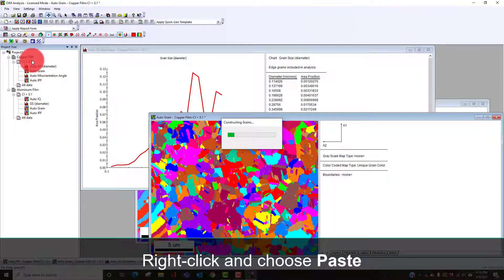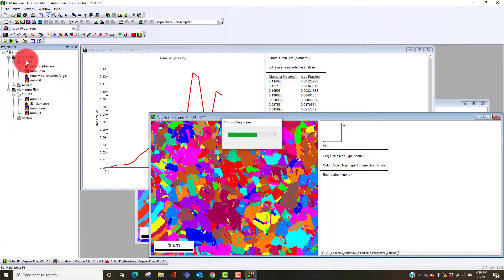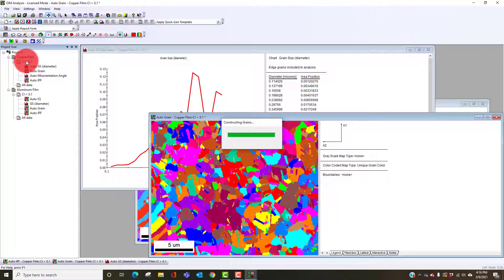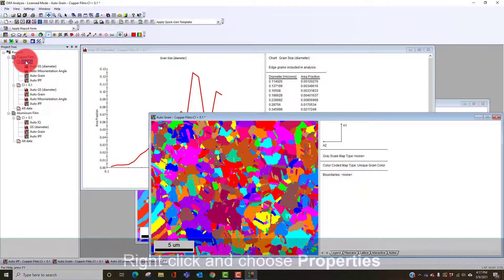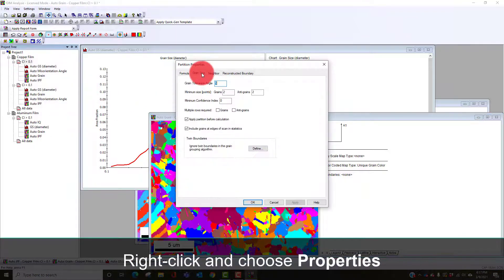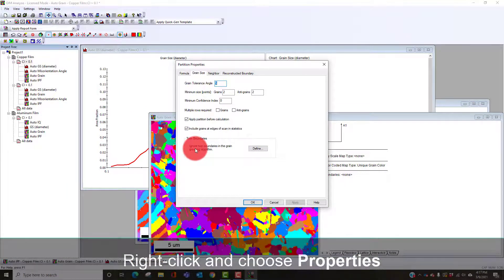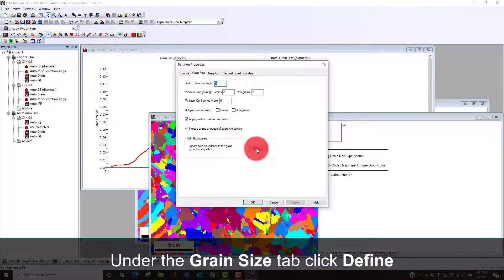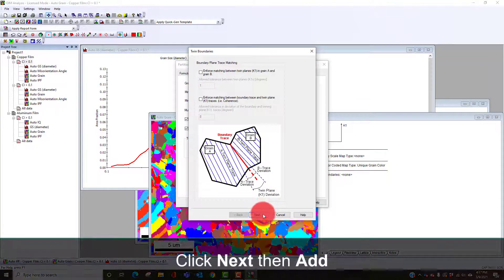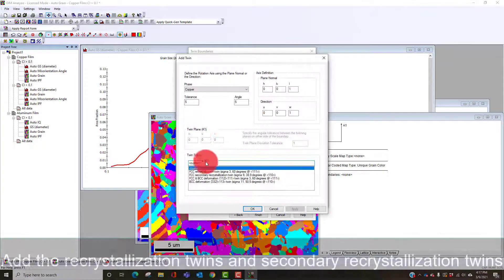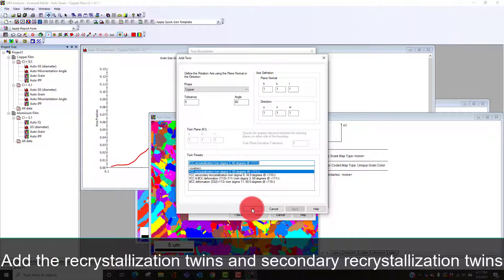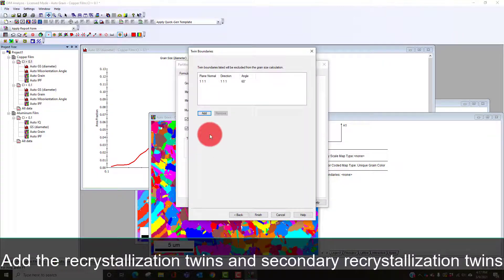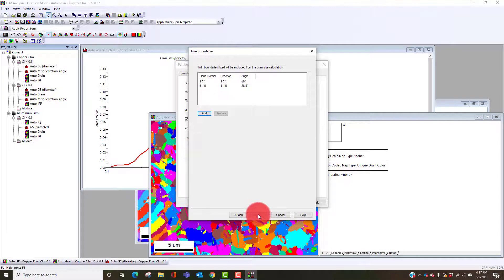Now if I want to remove the twins from this I can copy and paste my partition definition. Then what I'm going to do is adjust my definition. I'm going to go in here and say properties and grain size. There's an algorithm that says ignore twin boundaries from the grain grouping algorithm. I'm just going to select our recrystallization twins and I'll add our secondary recrystallization twins for copper.